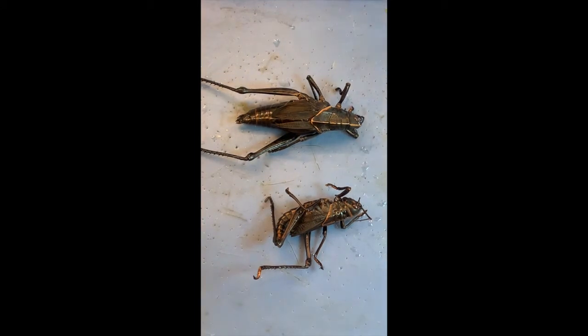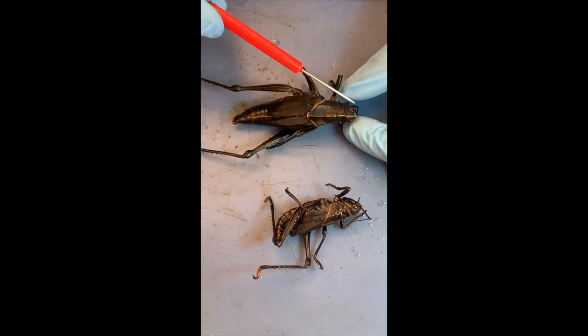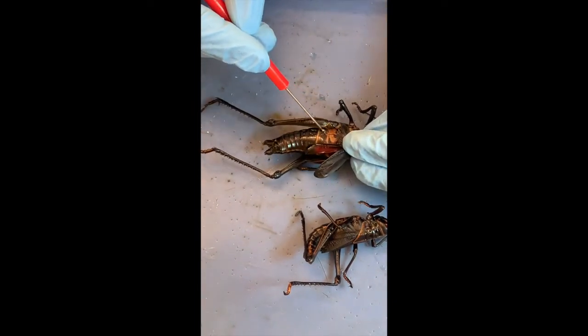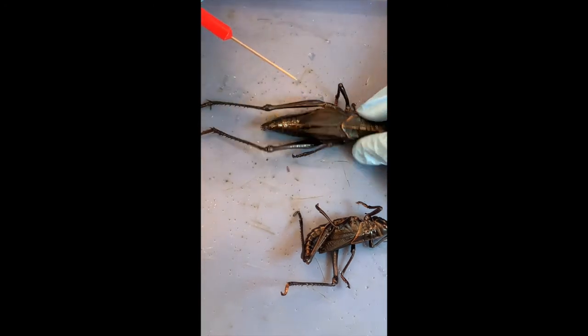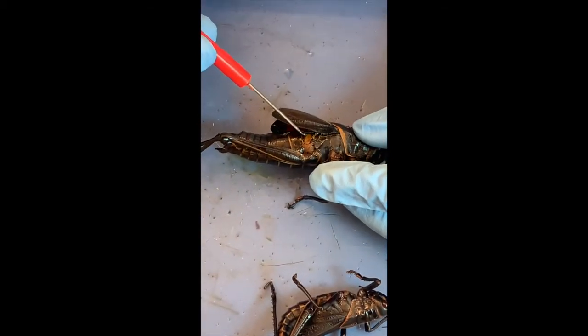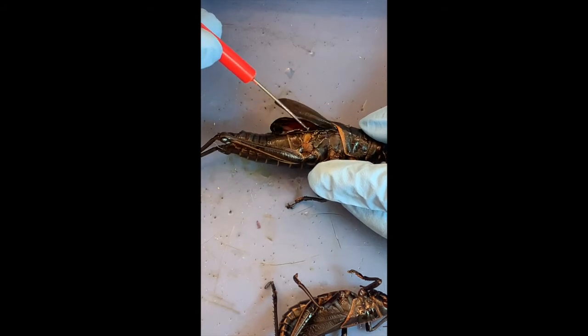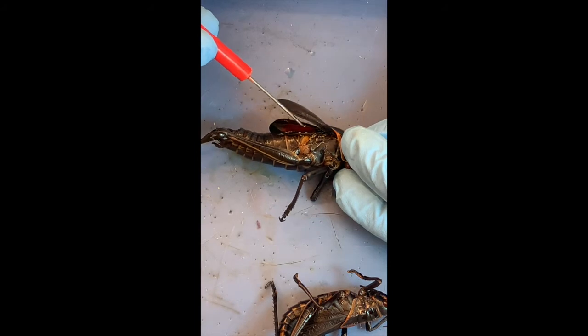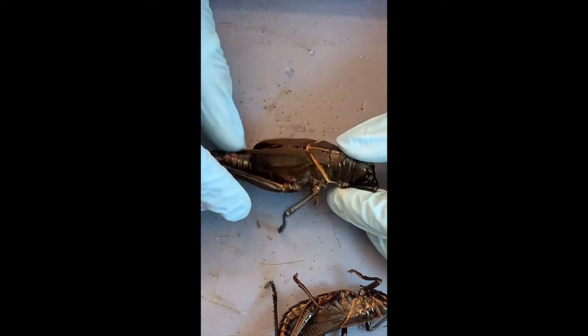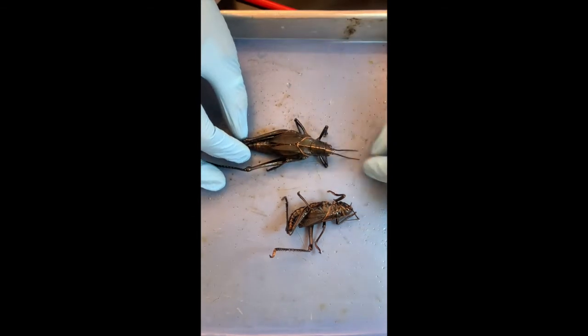Are there any other structures typically associated with the head that are not found on the head in this animal? So the way they hear — sounds — they don't have that on their head. They just have eyes, antennae, and the mouth. But they have a little membrane under their wings, and you can see it here, like a round structure, and then the same on the other side. You're telling me those are eardrums? Yes, it's just a membrane, so there's no outer ear like we have. And that's what allows them to hear sounds. So they breathe and they hear not on their head.